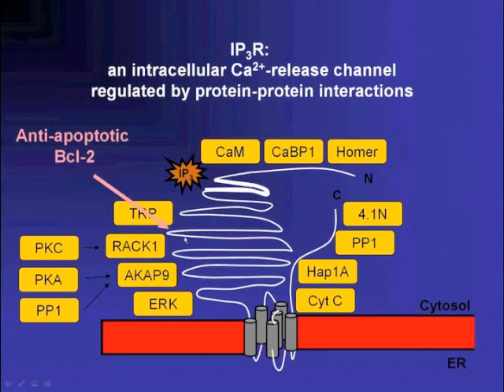show its binding to a very discrete region, a 20 amino acid region that is located in the center of this protein. Here is some data just to show you the challenging approaches that we needed to go through. With the IP3 receptor, when you want to study protein-protein interactions, you might want to chop it up in different pieces.